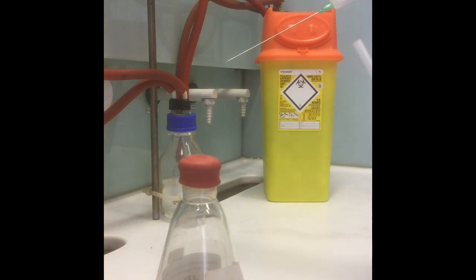Disposable needles should be placed in the sharps bins. If you use a disposable needle with a disposable syringe, both should be placed in the sharps bin. You do not need to remove the needle from the syringe before disposing of both. You should not replace the needle cover before disposal.